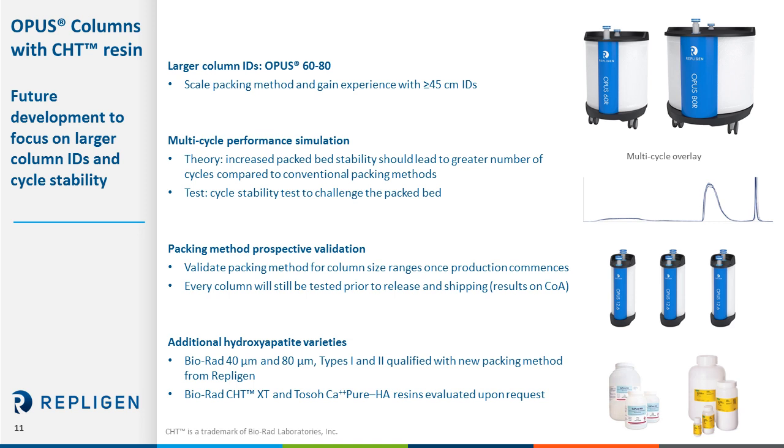Packing method prospective validation. As you've seen, we've been able to effectively validate the shipping methods for OPUS columns. And so validating the packing method is an additional benefit as we look towards the future and as we increase our volume of columns or number of columns shipped.